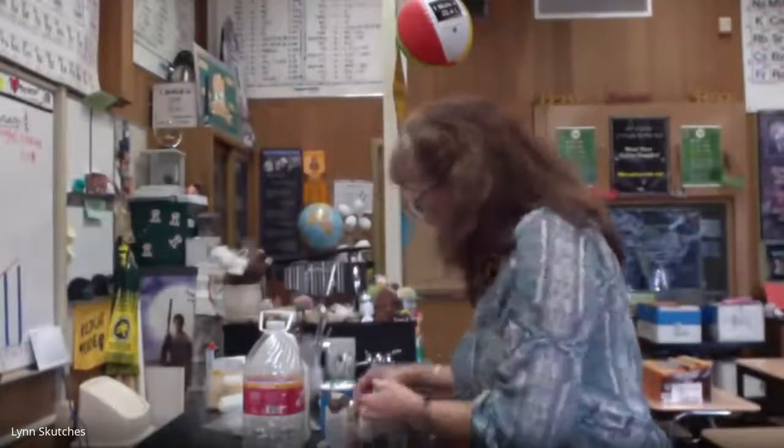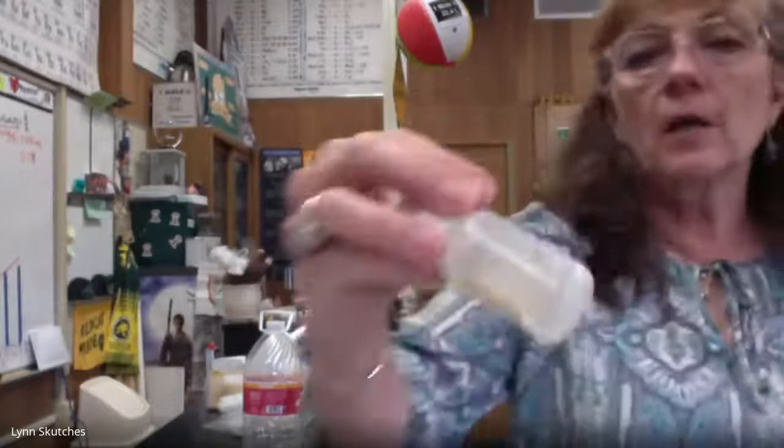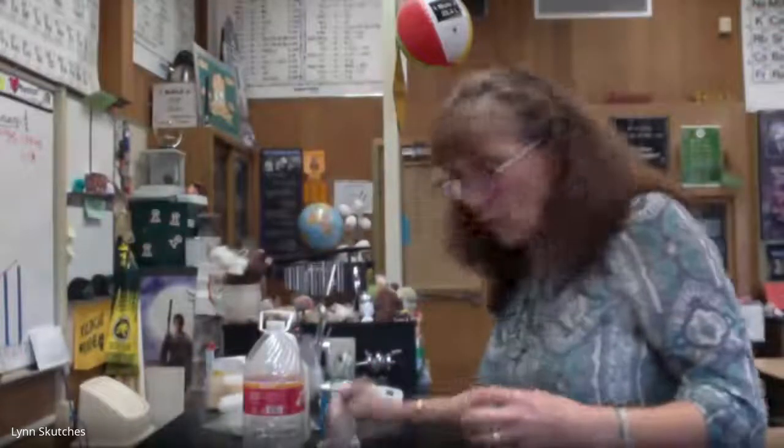And then the other substance that I have is this sodium hydroxide. Again, it just looks like water in there. Actually pretty dilute, but sodium hydroxide is nasty stuff. It's the stuff you use as drain cleaner, and also oven cleaners have it. It's called lye, L-Y-E, and it probably looks kind of black to you guys, but maybe you can tell it's actually kind of purple. And that is indicating that this is a very strong base, and a pH of 14.